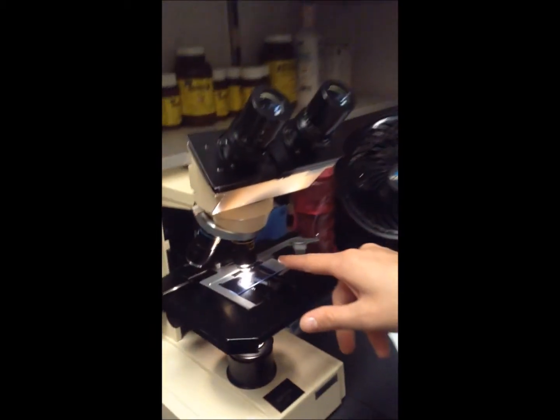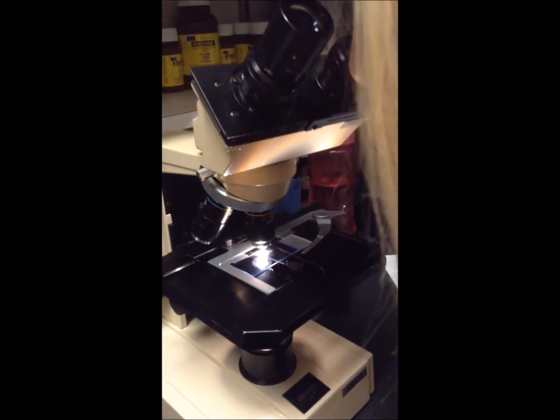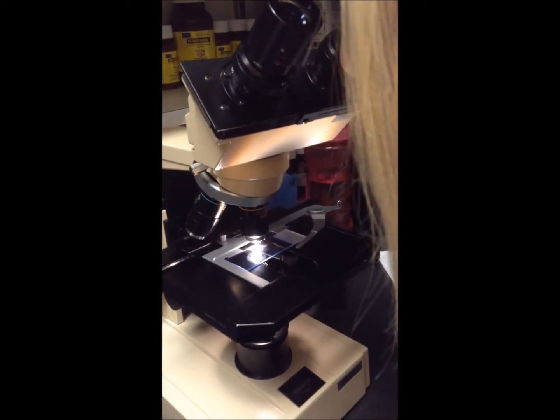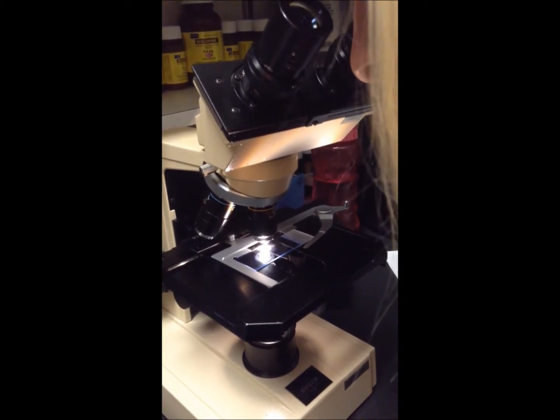You want to zoom in here? So we're on the 100th power at the moment, and we were just looking at the cells. And it looks like this particular dog was in proestrus when we took the sample. There's four stages of estrus. In each stage, when you look at it under the microscope, you're going to want to look for different types of cells, potentially erythrocytes, neutrophils.